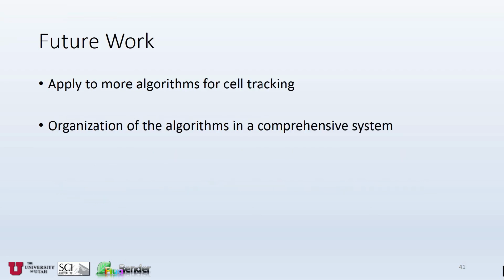For future work, we would like to incorporate more algorithms in our system and use the uncertainty footprint to evaluate their results. We will work with biologist users and organize all the functions in a comprehensive system for tracking different structures from research. The system design will not only be robust, but also provide intuitive operations for routine experiments and high-throughput data.